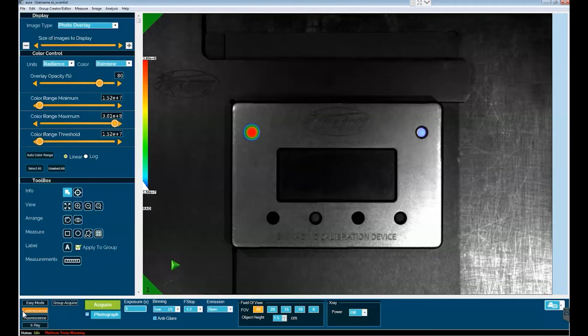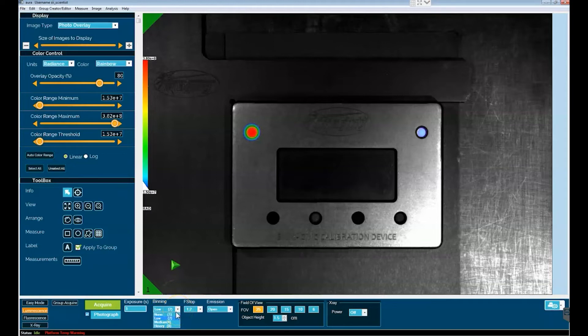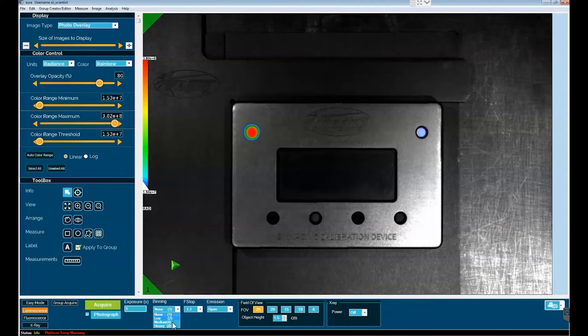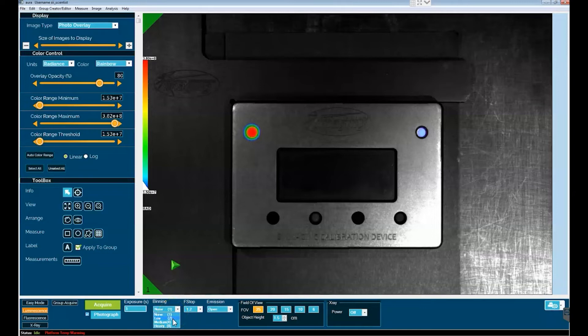You typically don't want to image longer than that. Binning options range from unbinned, designated as none or one, to heavy binning which is eight by eight binning, and typically one will use either low or medium binning.